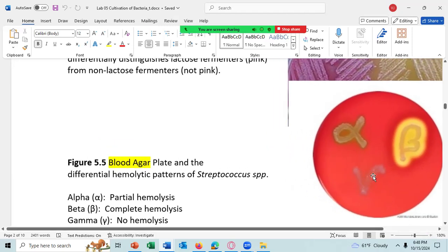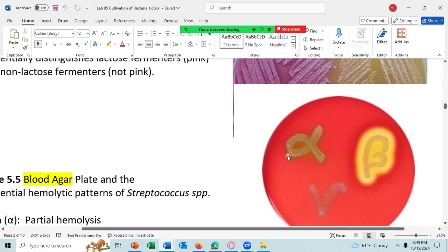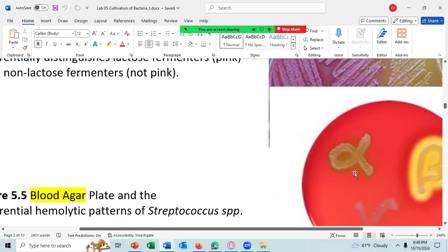Here is gamma hemolysis, also called no hemolysis, where the red blood cells are red all the way up to where the streaking of the bacteria is. Alpha hemolysis is the partial lysing of the blood cells, causing a dark ring around the streak of bacteria. Further out we have the red of the red blood cells. Inside the alpha region it is completely alpha hemolytic activity, meaning partial hemolysis.